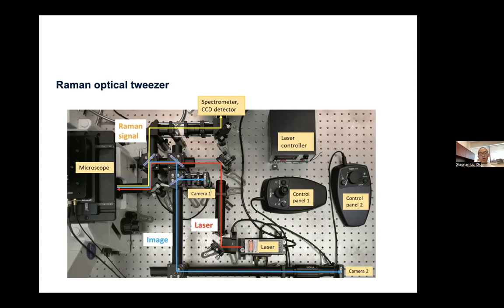So in this project, we used the Raman optical tweezer coupled with the microfluidic lab on a chip to successfully capture, detect, and discriminate a single bacterial cell. And after we got the ID of the single bacterial cell, we can artificially manipulate how the bacteria will move inside different chambers within the microfluidic devices.